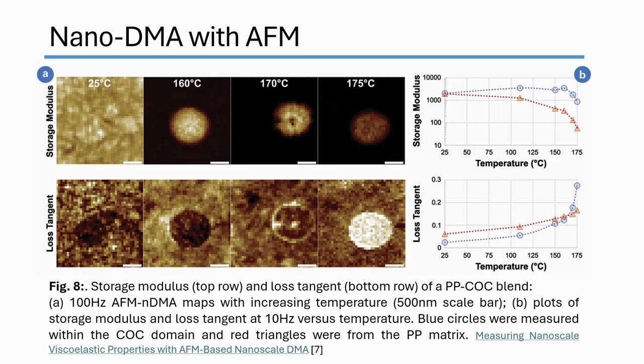However, as the temperature increases, we can see that certain regions are lighter and certain regions are darker. This is because when the temperature changes, the local properties change depending upon the material that is present. And this becomes really important because it helps us to understand how in changing different conditions, the local properties change depending upon what materials are present.